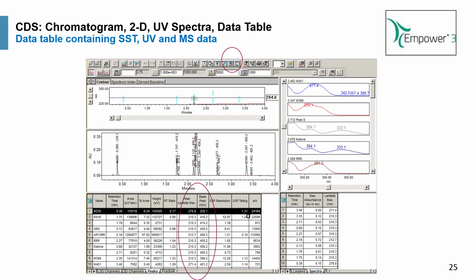Once again, here is also a data table. This is once again a Waters Empower 3 data table. So here we have the chromatogram, which is automatically annotated and labeled. This is really nice. Now in Empower 3, if you have a QDA, a simple single mass spec, there's a mass analysis button. Once you press that, something magical happens where you can port over the parent mass spectrum automatically onto the chromatogram. So it's very, very helpful.